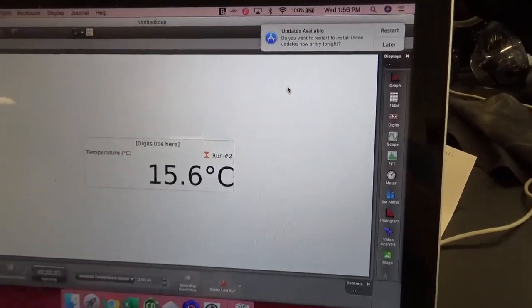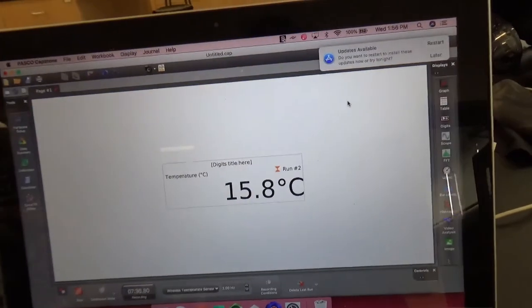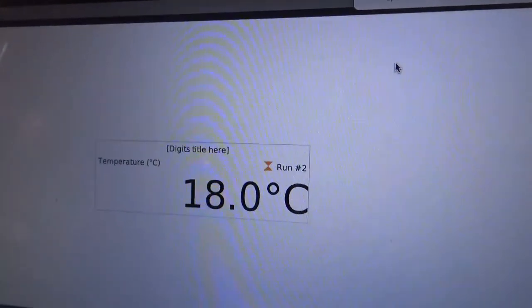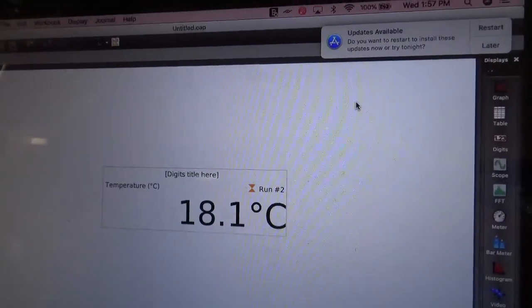You might be able to heat it a tad more. No? Feel it. It's actually warm. It's actually too hot. Oh wow, it's very warm. And if it does get a little higher than 25, no problem, because I'm not at the saturation point yet.